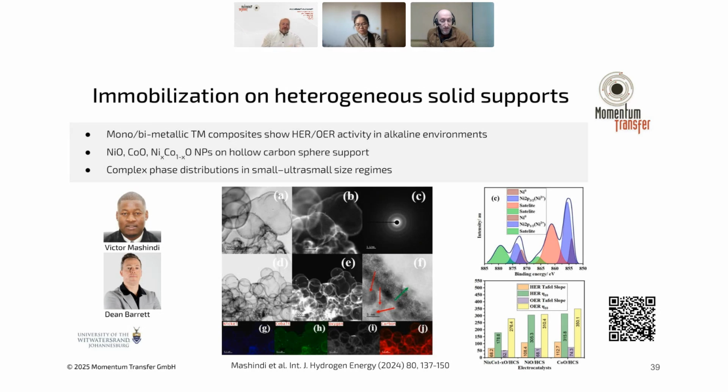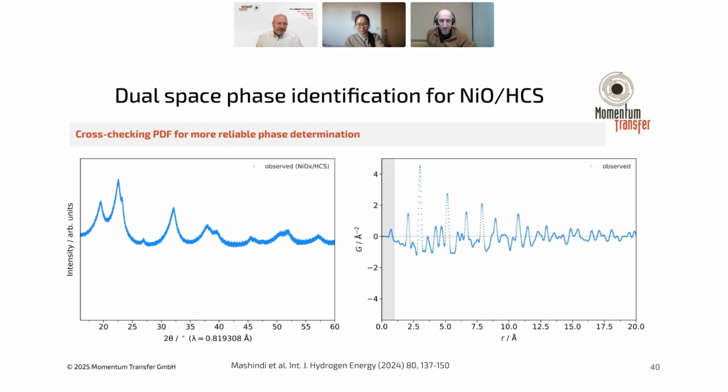And we see quite complex phase behavior, so it's very interesting, I think. This is what the diffraction pattern looks like. And I should say, you don't want to do PDF analysis completely independent from your standard diffraction analysis, because that is always the good starting point to understand your system up to the point that you can with standard techniques, so that you really know what else you should be looking for in the PDF.